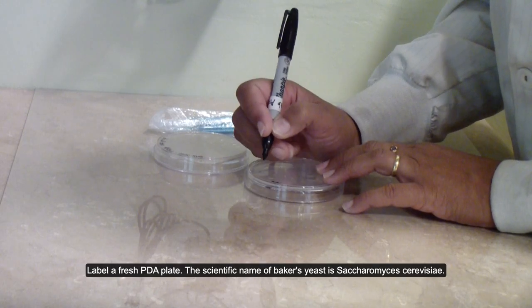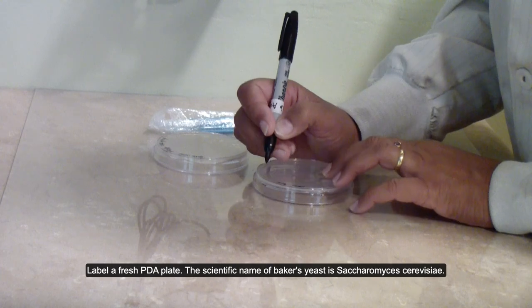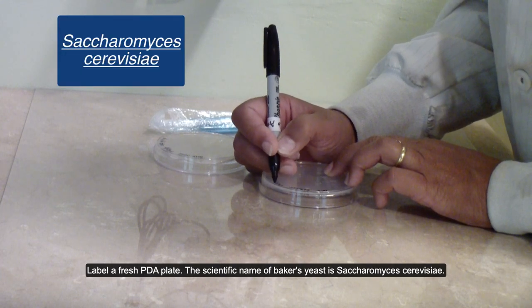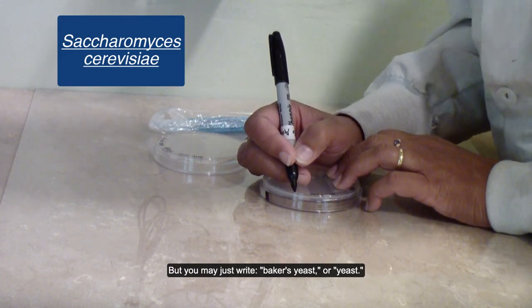Label a fresh PDA plate. The scientific name of baker's yeast is Saccharomyces cerevisiae, but you may just write baker's yeast or yeast.